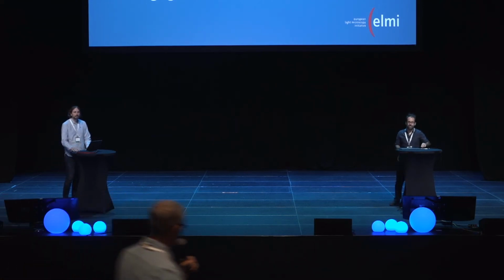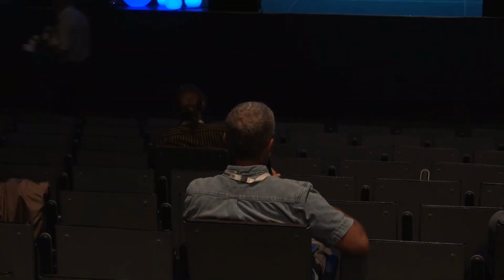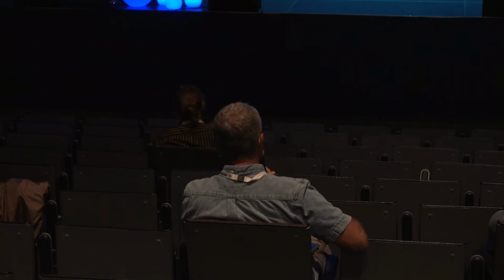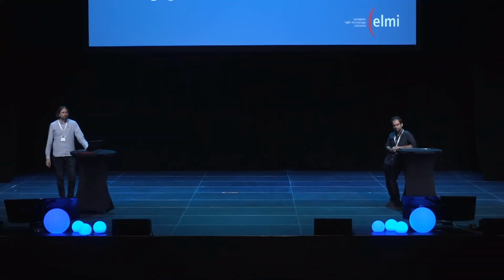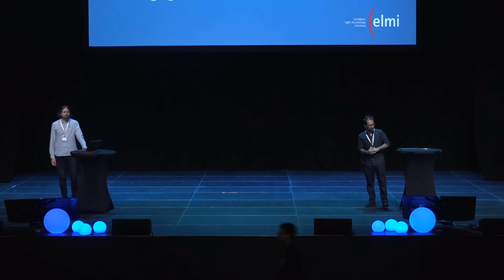Thank you, Ricardo. Thank you very much. I have two questions. First, about the applicability of SRRF on Airyscan: what to calculate first, Airyscan processing or SRRF? And second, a question about live imaging applications. Did you think about developing something like a rolling frame, rather than fixed blocks of 100 frames?